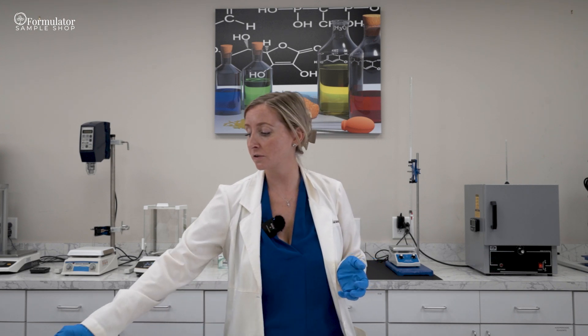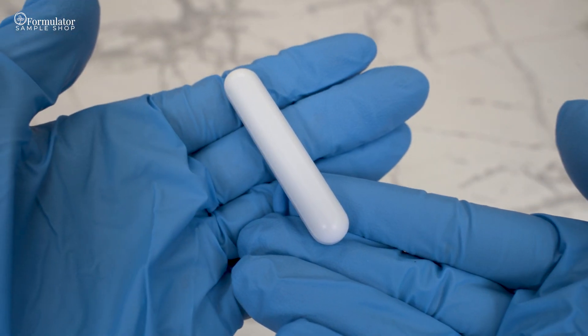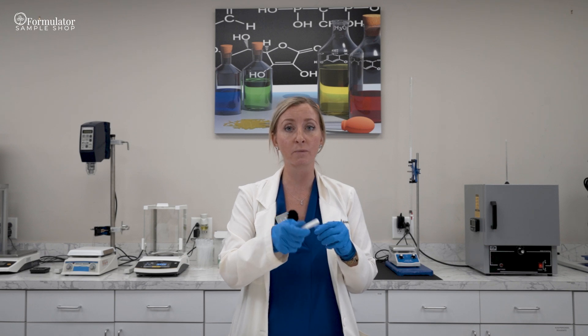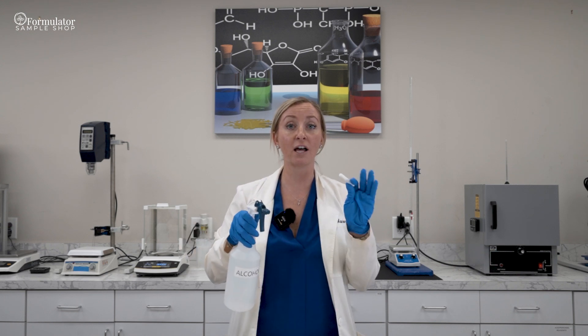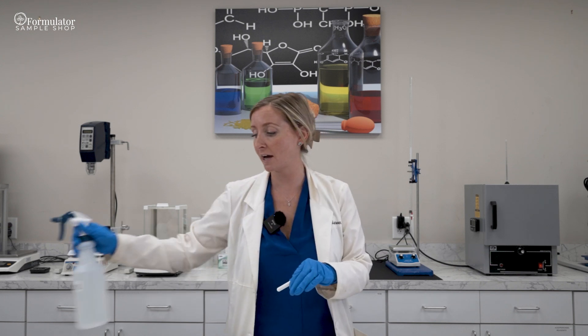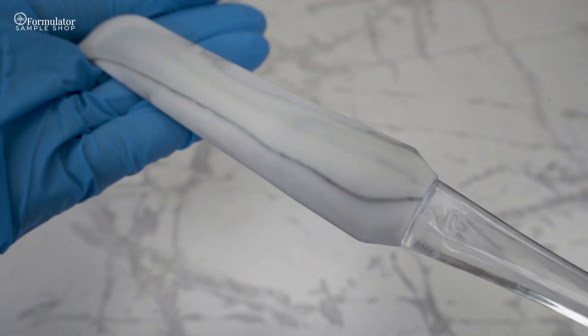You also want to make sure that any lab equipment that's going to touch your batch is also sterilized. Things like stir bars, you want to make sure that these are clean before you work with them. These could be rinsed with soap and water, put in the dishwasher, whatever you have on hand. But once that's done being cleaned, you want to spray it with alcohol and let it dry before using it in your batch. The same process goes for things like spatulas, so make sure that you spray those with alcohol to make sure that they're clean and dry before you use them in your batch.